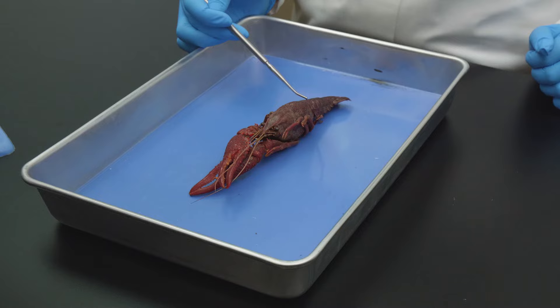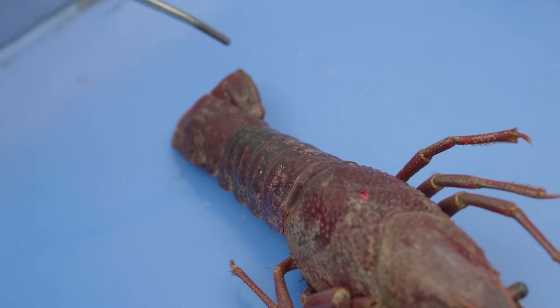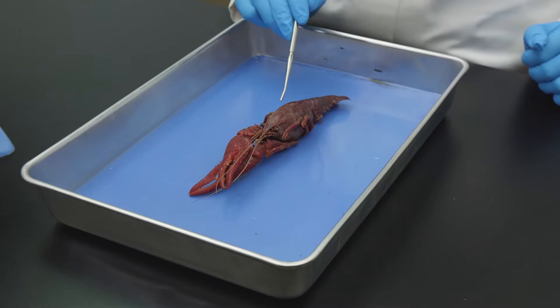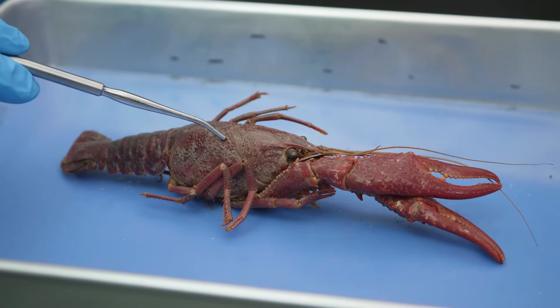The abdomen is divided into six segments that end with three fins, which make up the tail fan. The crayfish's body is covered with a hard exoskeleton made of chitin and calcium carbonate.